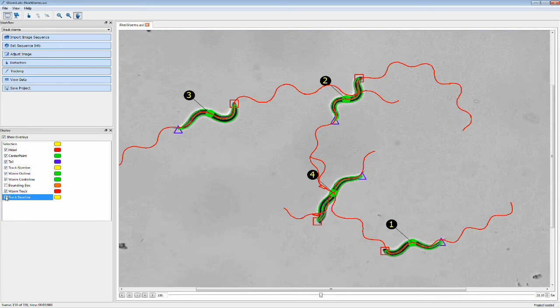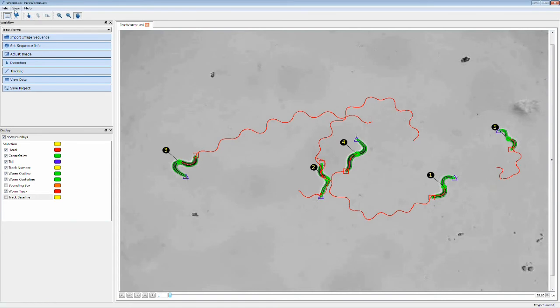Now, one of the things that you can do with this is once you've tracked your worms and you have this graphic display, you can choose to export it by either taking a snapshot, that's up here on the menu, or we can export the video. When you export the video, this little window comes up, and you can choose what frame range you want to export and what file. It'll export whatever is on your screen, so it'll take the original worm video with the graphic overlays. If you only want to export a single track, you can delete the other worm tracks, leave just the one track on, and export that single worm. So the export feature is ideal to include these worm videos after they're tracked in your presentations, or to include as supplemental materials for your publications.